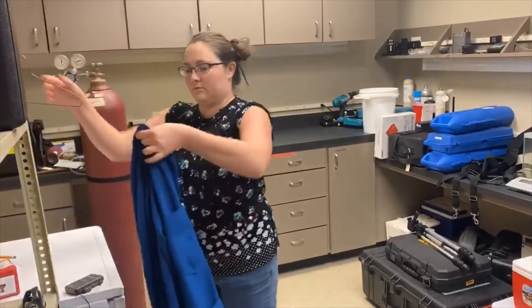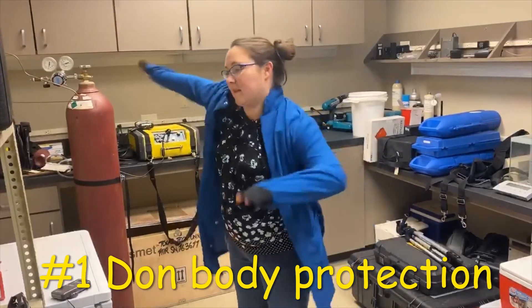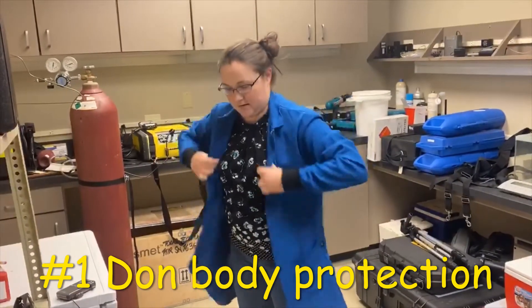The first step in donning is to put on your body protection. Ensure that lab coats are clean and buttoned up completely.